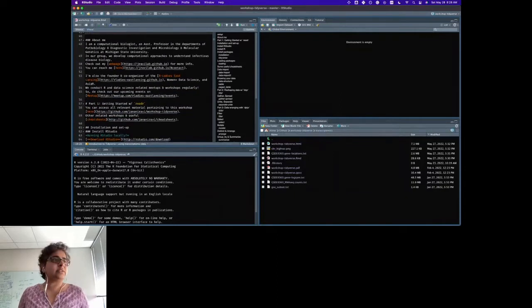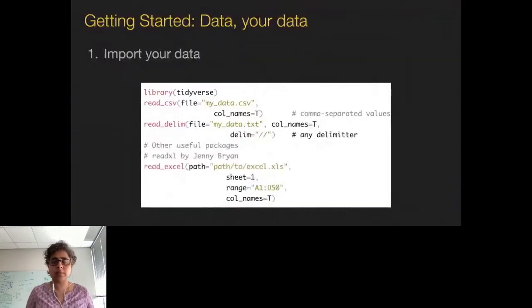So let's get back to the presentation quickly. Thank you, Janani. Oh, no problem. If anybody is still having trouble, please let me know. I only see green cups right now, so I think I'm good and I'm going to proceed.